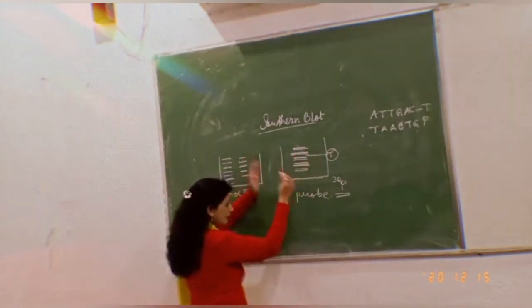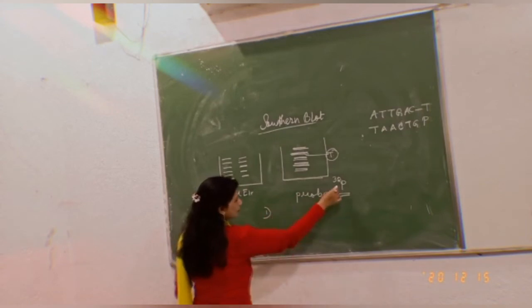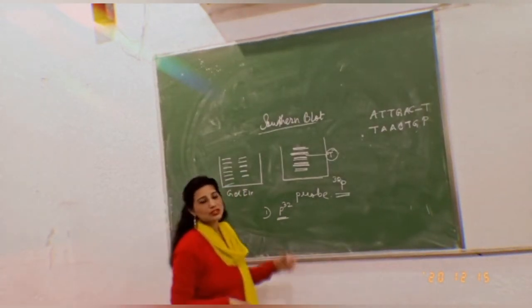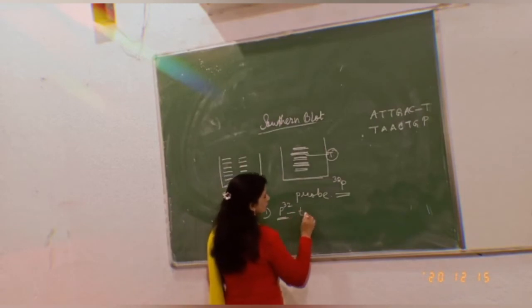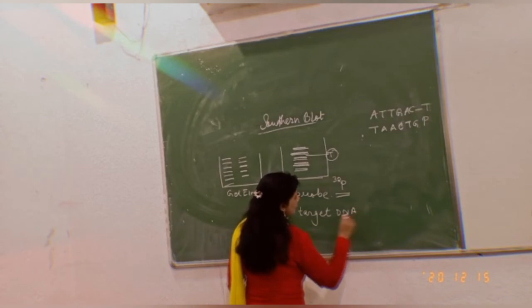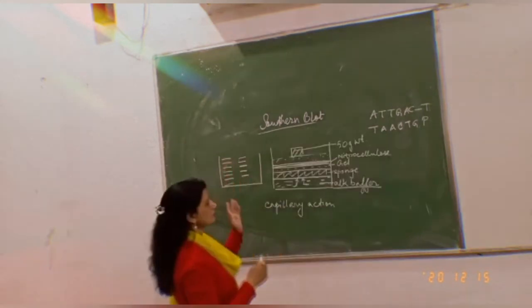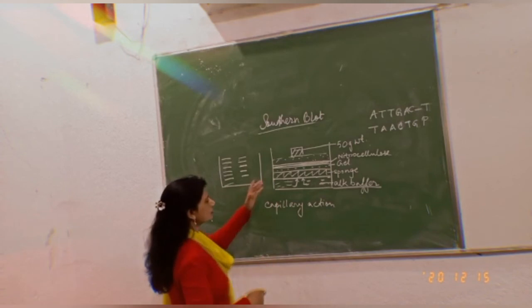And after that, there are some ways by which, one is by P32. If I am using it, this radioactive isotope can be easily used to locate the particular target DNA sequence. As P32 is also present in the DNA molecule, it will locate it. And after that, I have right now got the exact replica.